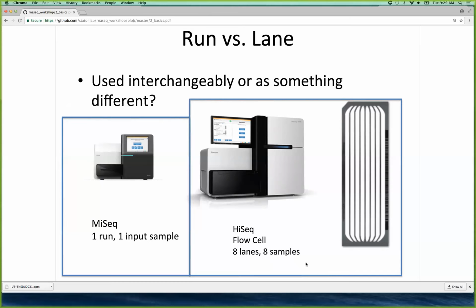So I work with Jason Holliday at Virginia Tech. And he sent me this paper, and I can't remember the first author, but they've published this incredibly cheap RNA-seq library prep. It's like $20 a sample. If your labor's free, right? Like, labor's never free.